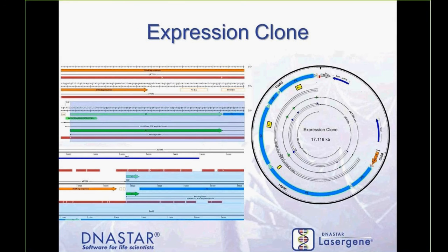So this is an example showing that entire precursor that's been inserted into that pET39b multiple cloning site. As you can see, the parental information from the vector as well as the information from the target is carried over and applied and annotated to that express clone.